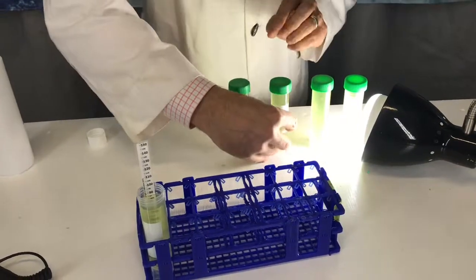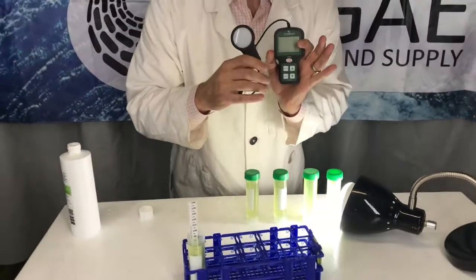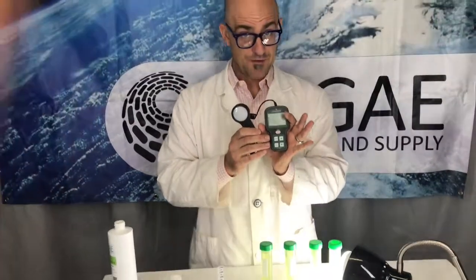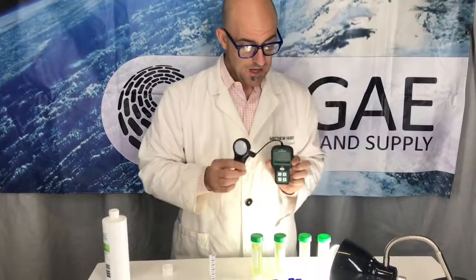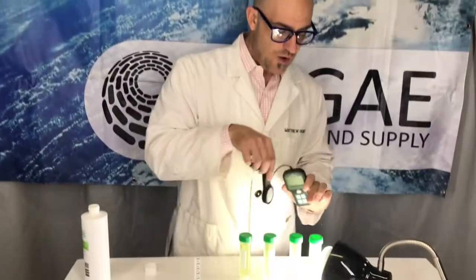You can take a light meter — this is a PAR sensor measuring light between 400 and 700 nanometers, which is the photosynthetic range that plants and algae can use. You can either use this, or there are great apps on your iPhone or any smart device that work as light meters and they work great.